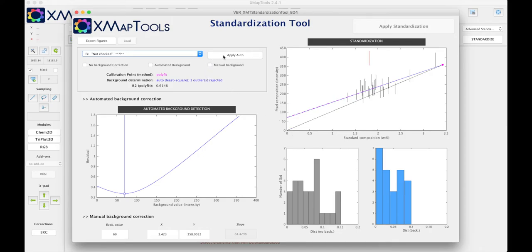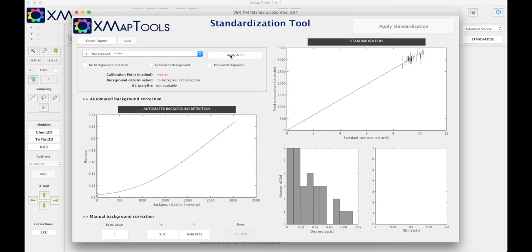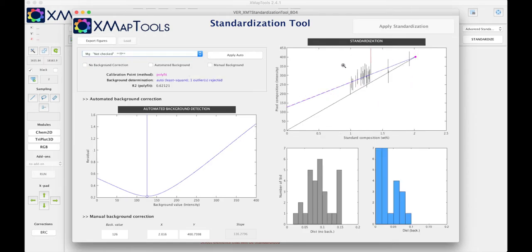For iron I just press apply auto because the program correctly detected the trend in the spot analysis. For potassium there is no need for background corrections, we can just press apply auto. Same for magnesium, there is a background correction but the program was able to find the trend nicely.